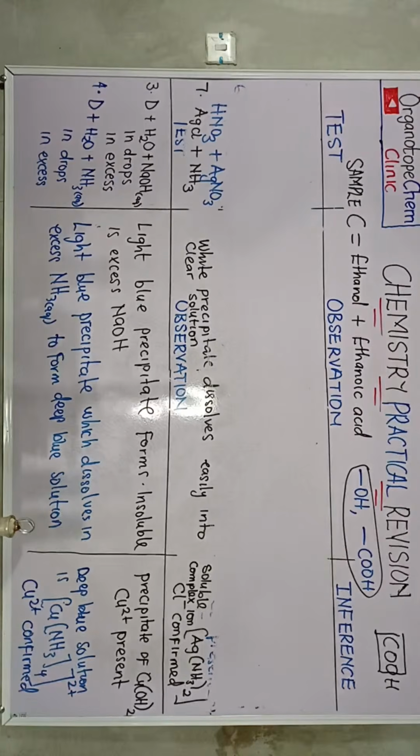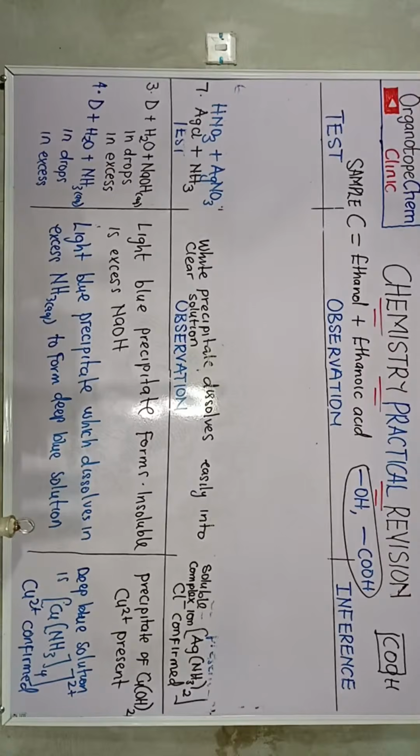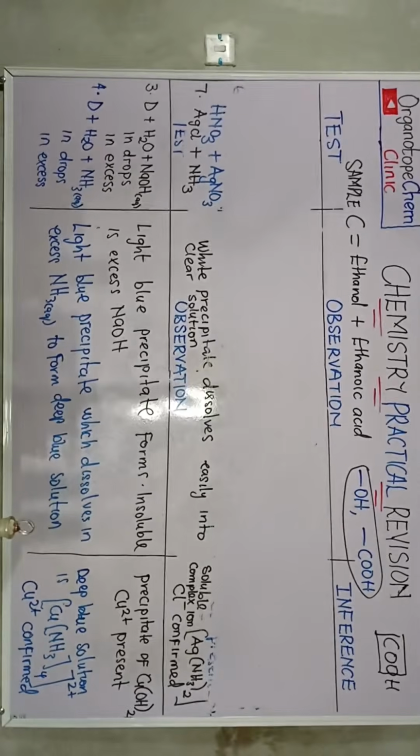What is the molecular formula for lime water? Yes, I need your responses, please. Yes, calcium hydroxide from Dave.